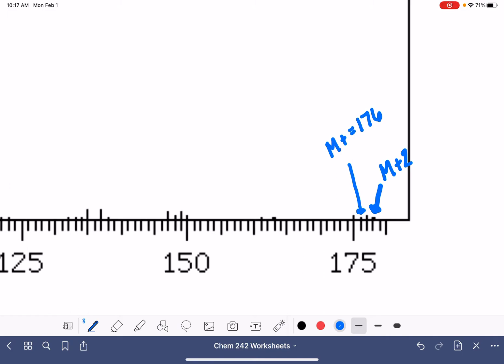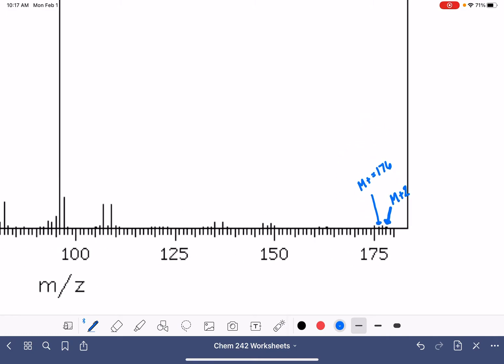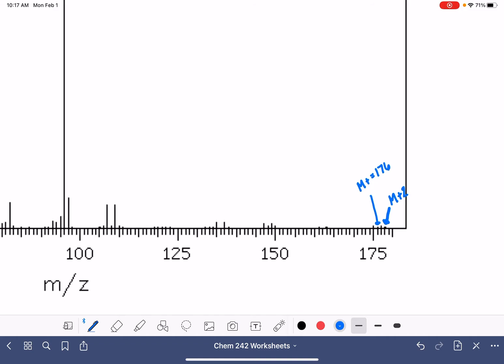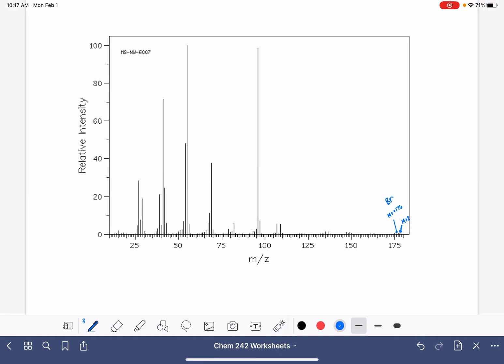This is a really difficult one to analyze because of how low intensity all those peaks are. And then because we have the M plus two peak that is equal in size, we have bromine present in the molecule.